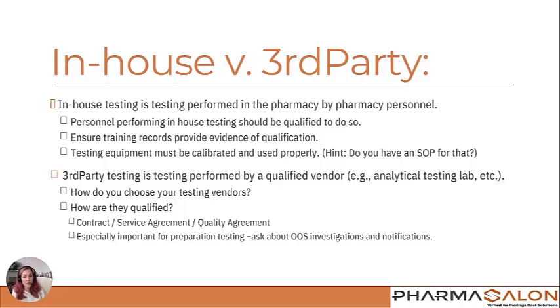Your equipment, if you have testing equipment, needs to be calibrated itself. So for example, if you do your own viable air sampling in your clean room and you have an air sampler, that needs to be calibrated on a regular basis. Are you calibrating that equipment? The answer should be yes if you're going to use those results. Also be thinking about, do you have an SOP for that? If you're doing in-house testing, you need to have that process in an SOP documented.